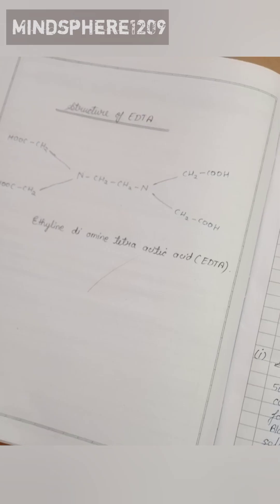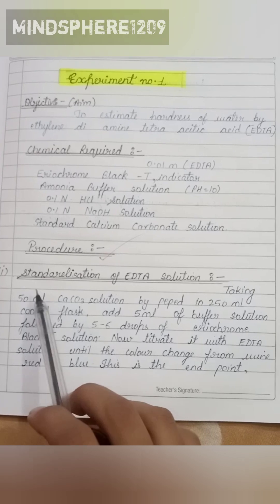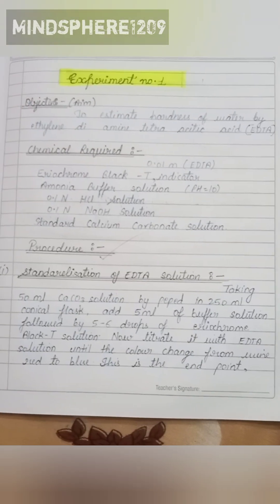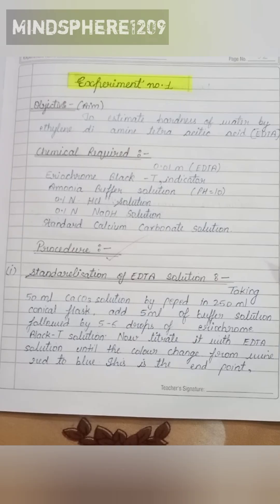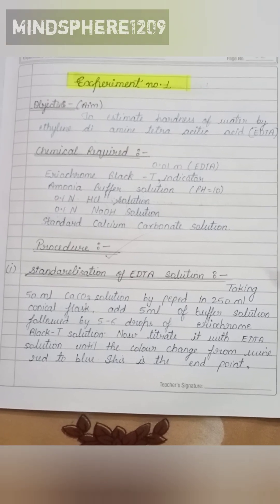The structure of EDTA is shown here. Now for the procedure — the first step is the standardization of EDTA solution. In this step, we take 50 ml of calcium carbonate solution by pipette into a 250 ml conical flask.